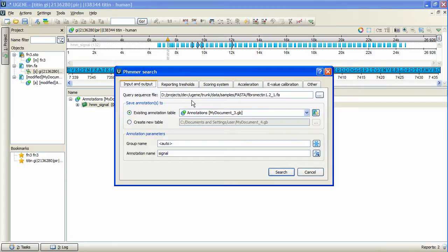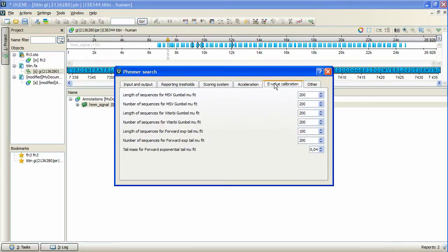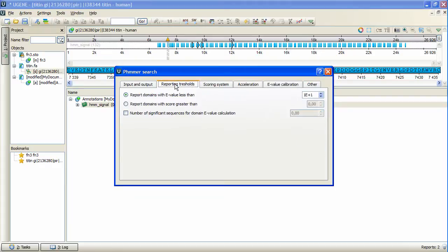It is possible to specify the build options contained in the Scoring System and E-value Calibration tabs. The search options are filter options in the Reporting Thresholds tab and Acceleration options.